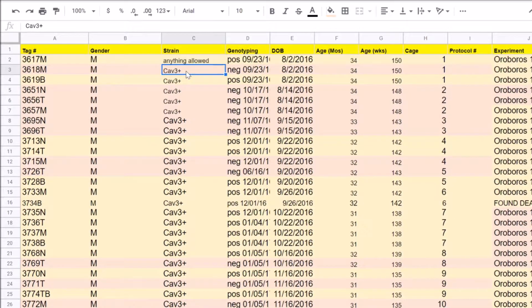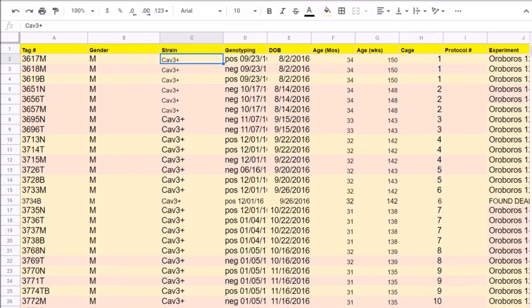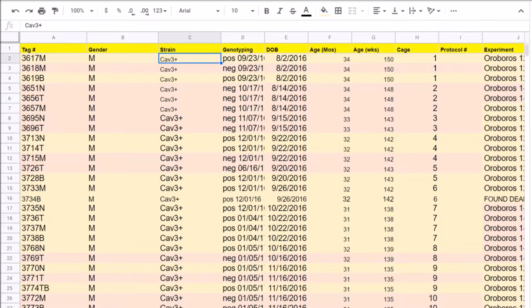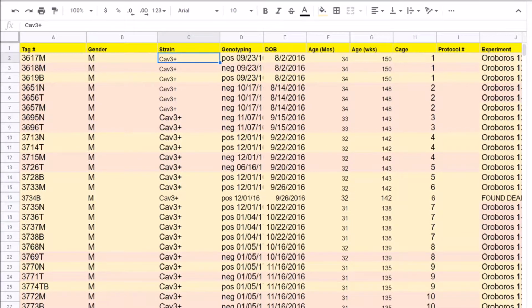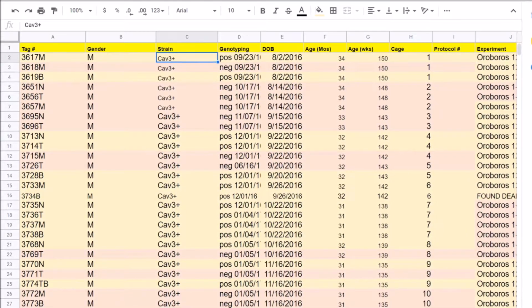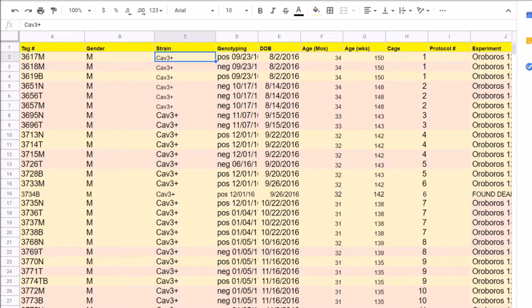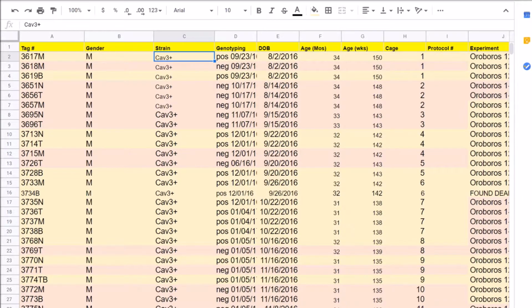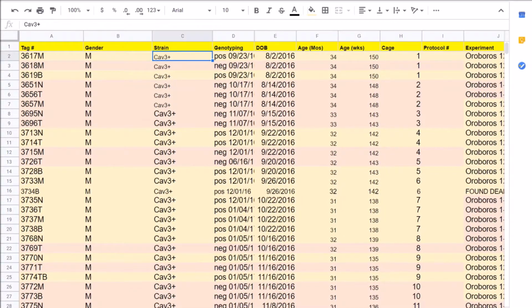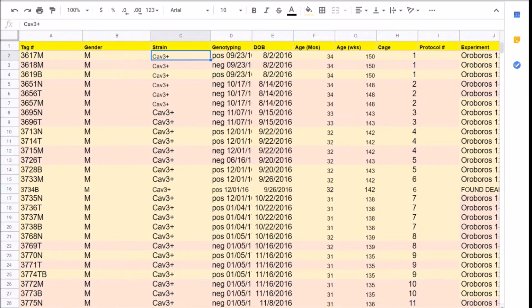In fact, you cannot trust any of your data because whenever you think a value might be wrong, you don't know who entered it, right? So you don't know who to ask. What you really miss is version control. It's a very common feature in content management systems. Imagine the impact such mistakes can have on your study. You might have to repeat everything. Animals had to suffer for no reason. Months of experiments and thousands of dollars could be lost.